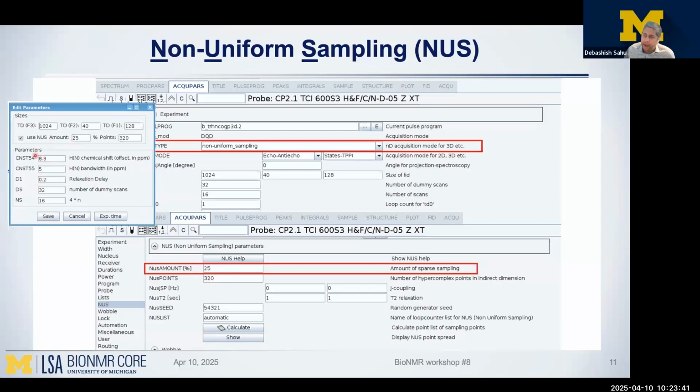And again, this is combined with your best TROSY experiment. So basically, you have your best parameters over here, and this is the TROSY experiment. So you combine all that, and for probably a fraction of the time, you get much higher signal to noise. That means that you can effectively get very good signals for the same amount of time when you combine all these techniques that I talked about.